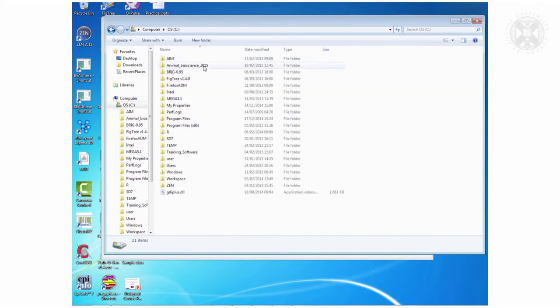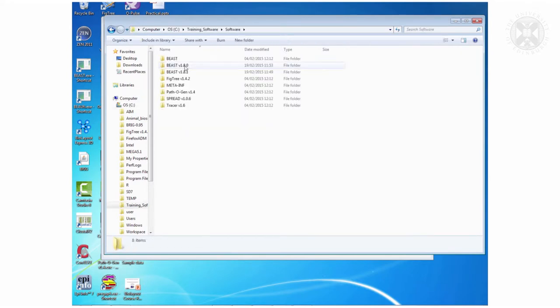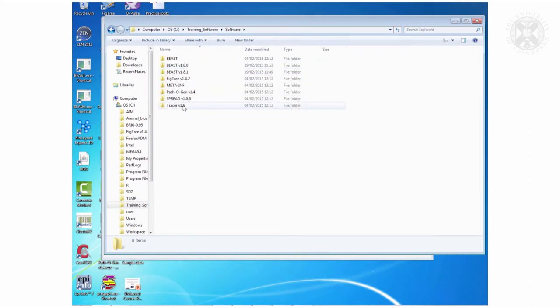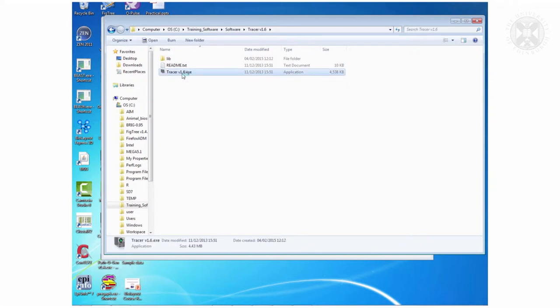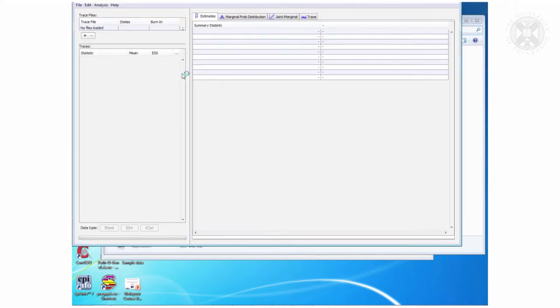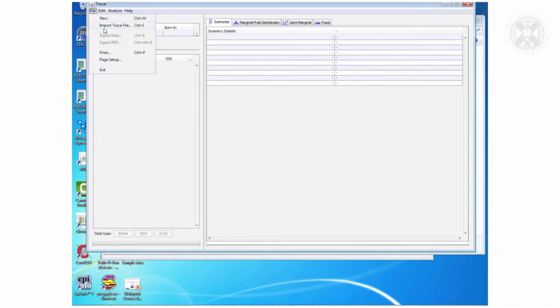Tracer is again it's in that training software programs file in software. Tracer. So this is Tracer and this will let you load in those log files.